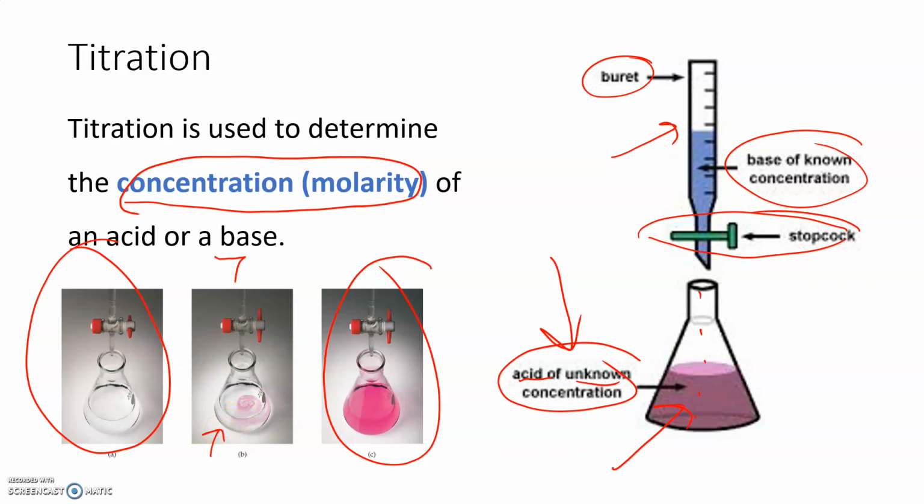Why I said you would hate to do this in person is if you add one extra drop of base to that neutral solution, the whole thing turns hot pink and you have to start over.